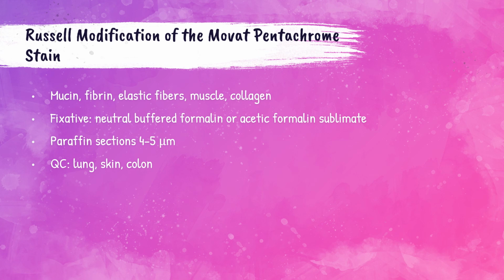Any leftover iodine is removed by sodium thiosulfate. Acid fuchsin and Biebrich scarlet stain muscle, cytoplasm, ground substance, and collagen fibers. Then phosphotungstic acid removes the stain from collagen and ground substance, and acetic acid removes the phosphotungstic acid. Then the collagen is counterstained with an alcoholic saffron.